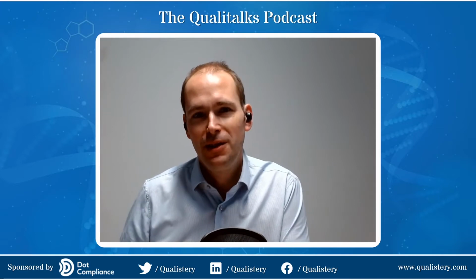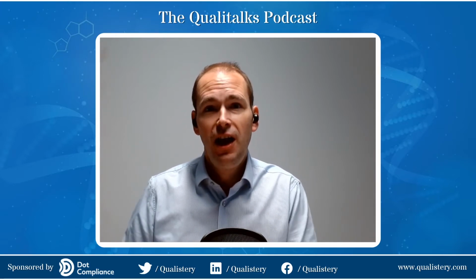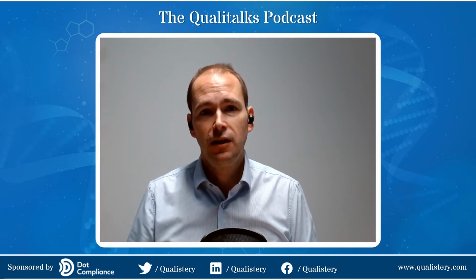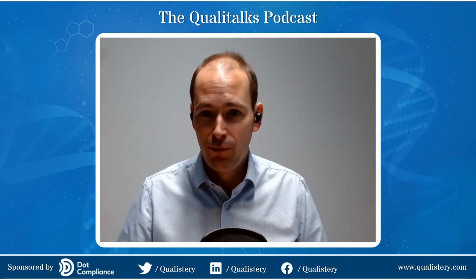understand how we are going to be using it. What are the likely pitfalls during the qualification stage? And how is the process going to work? How are we going to load it? And when you can understand all of that information, you can then start filling out your URS and saying, we're going to need this additional functionality. Because typically autoclaves come as an autoclave and they'll come with functionality to sterilize the loads.